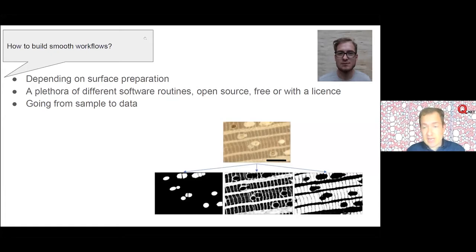So here you see a Polyalthia sample. It's from an understory tree from the Congo Basin. And basically what you want to have is you want to annotate wood anatomical features. You saw the triangle from Lenka. You want to have vessels, you want to have parenchyma, you want to have fibers, the three broad anatomical traits. So on the left, you see the vessels, then you see the parenchyma in this case of the Annonaceae, and on the right, you see the fibers. And if you want to go a step further, you want to measure the fiber lumen thickness or the fiber wall thickness. The next slide, Giulia.